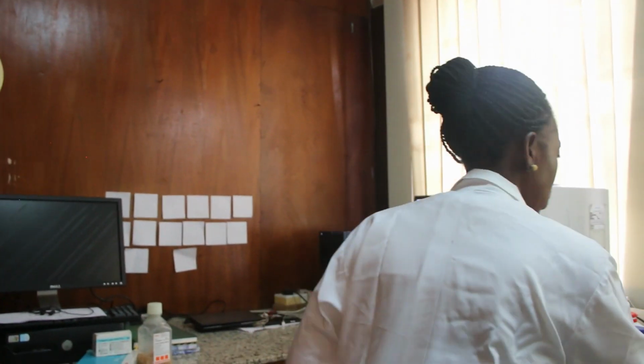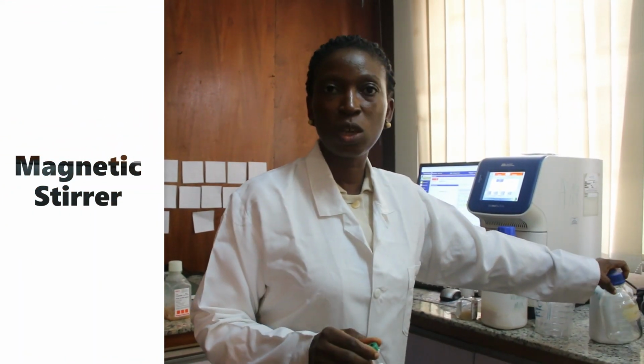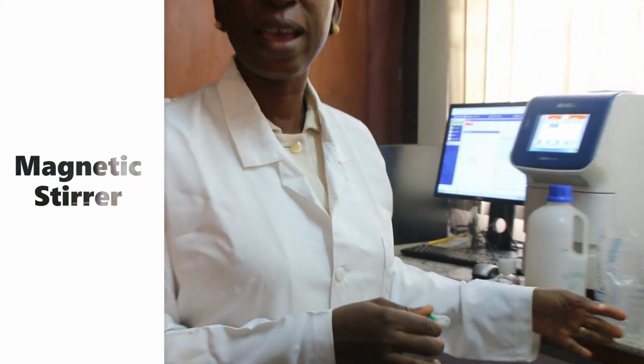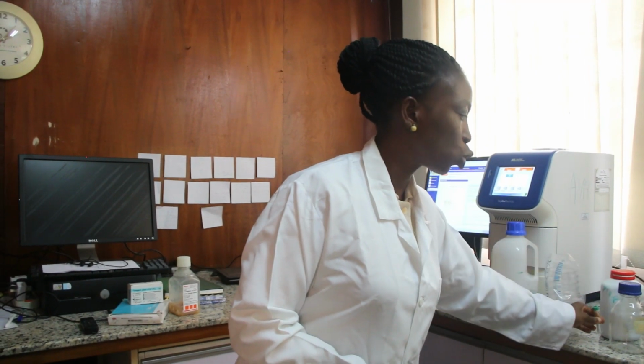While autoclaving, a magnetic stirrer is introduced into the mixture of the distilled water and agar and autoclaved with it to avoid contamination. After this, it will be allowed to cool.